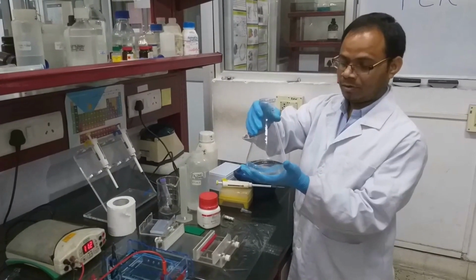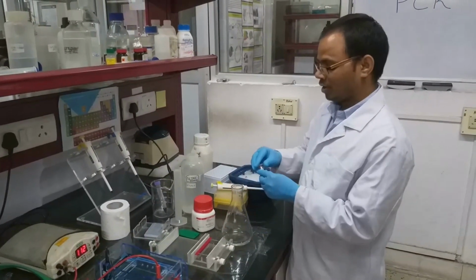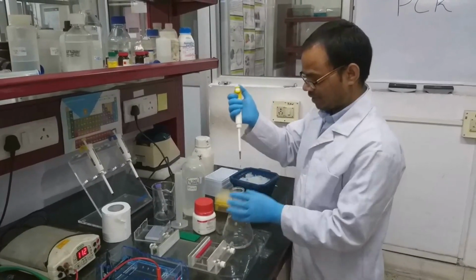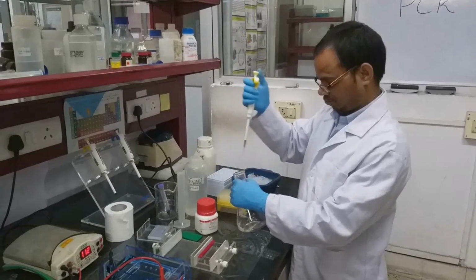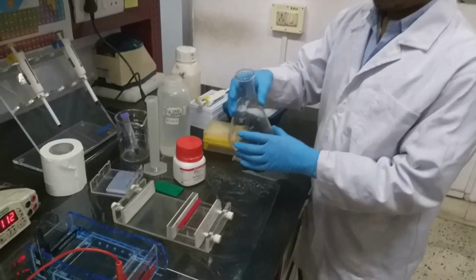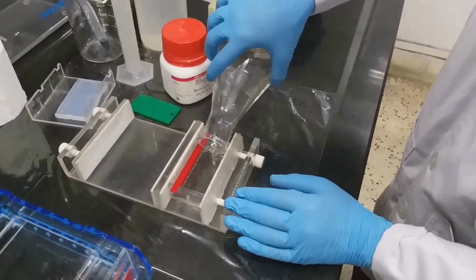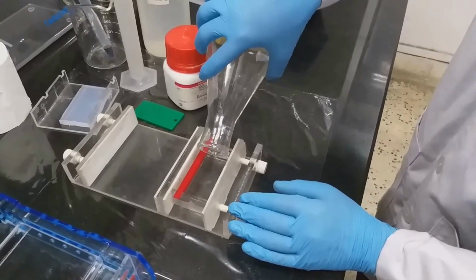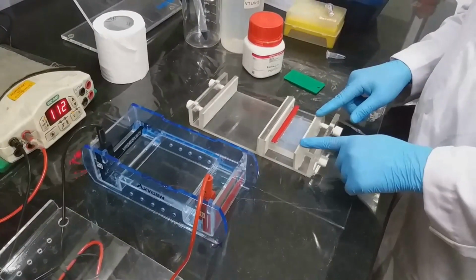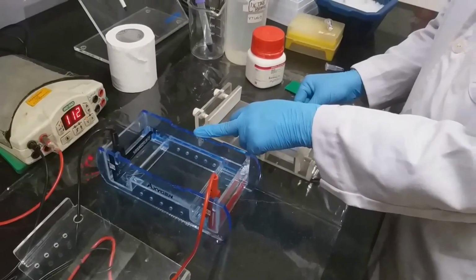We have to let it cool down to 50 degrees Celsius. Now before pouring we have to add ethidium bromide for detection purpose. Now the gel got solidified. We have to take out the gel and keep it in the electrophoretic apparatus.